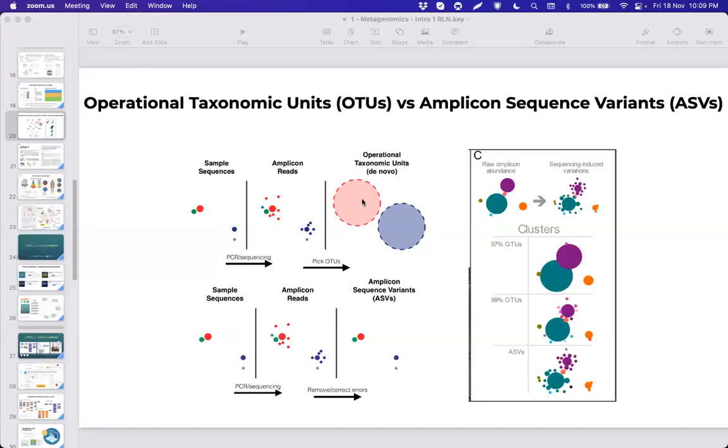So we have to quickly go to this also. For example, you can see that OTU just merges your sequences by their identity percentage, right? It doesn't estimate whether or not that identity percentage might have occurred by chance or by anything else.